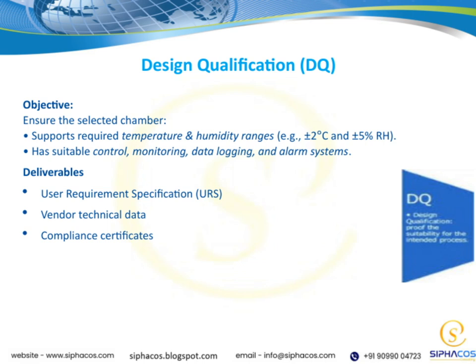Additionally, alarm systems are vital. They alert us immediately if anything goes outside the set parameters, helping us prevent any potential issues.